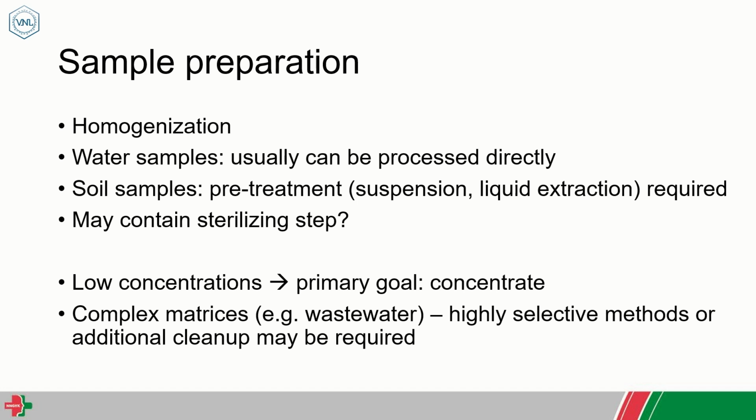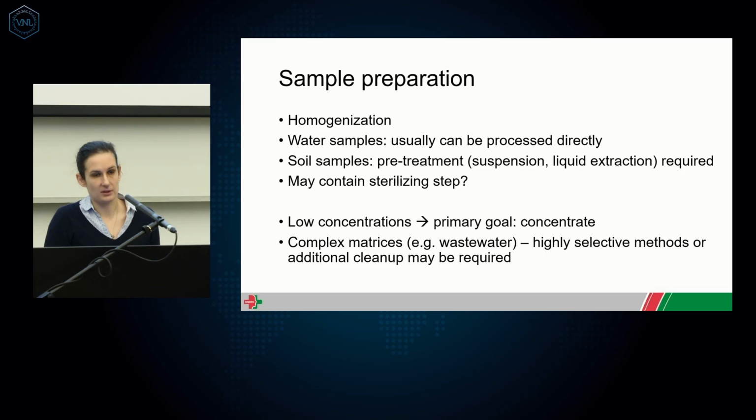Maybe there is an opportunity for sterilizing steps or other steps that can decrease the risk and ease the work. But we have to think about it also during the sample preparation.